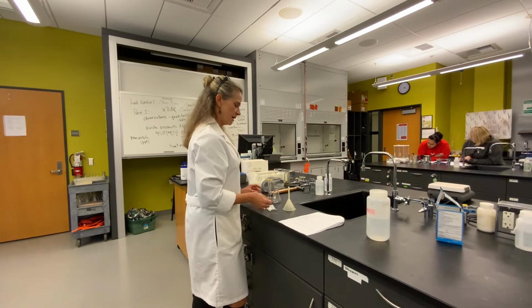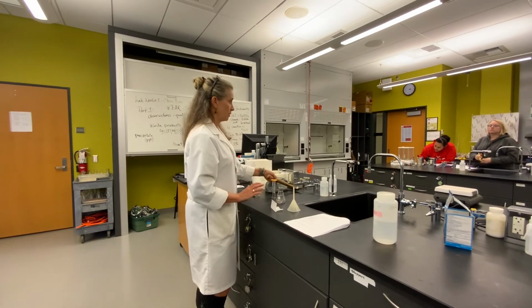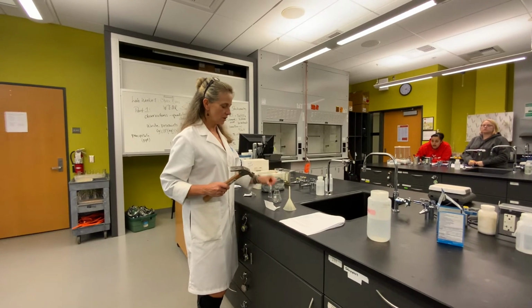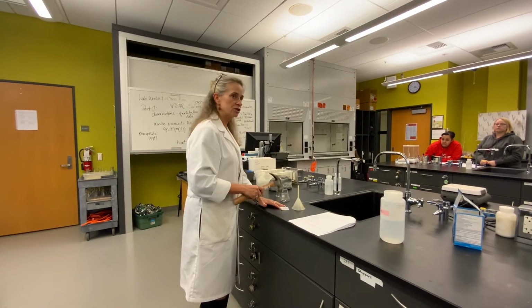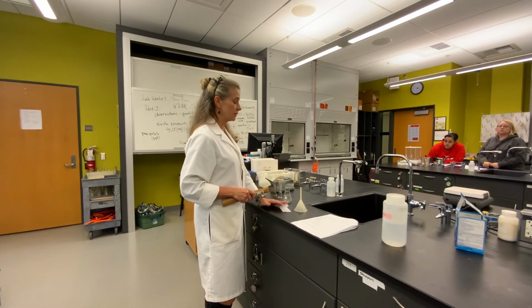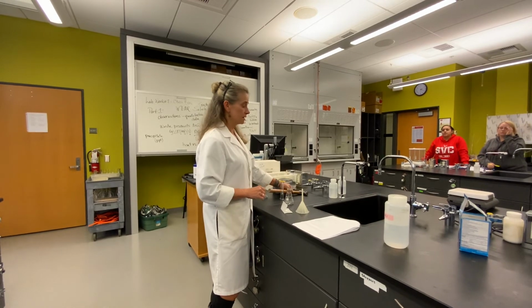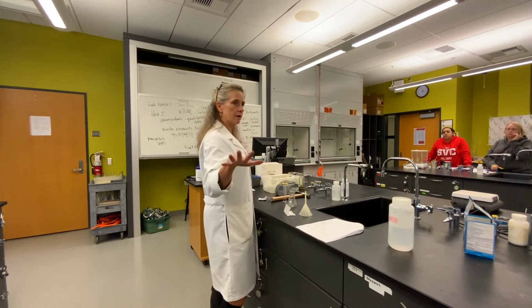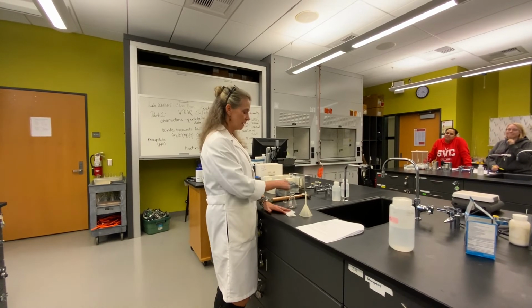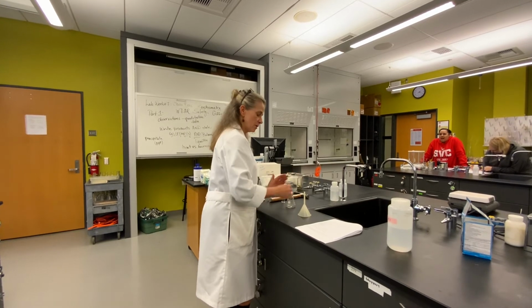So this time, you're going to use the magic chemistry hammer, okay? Because this won't fit in the flask, right? So we're going to use the magic chemistry hammer and just gently tap it. You don't need to crush it into a million pieces. It just needs to be small enough to go in the flask, okay? So I had a student just wail on it and send it everywhere, all right? So just gently tapping, this is fine, getting it in there. And again, I would encourage tapping it in there so you get all of it.